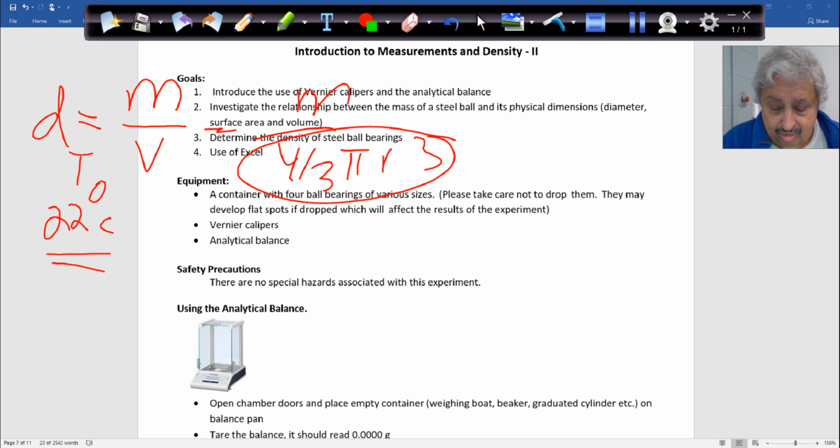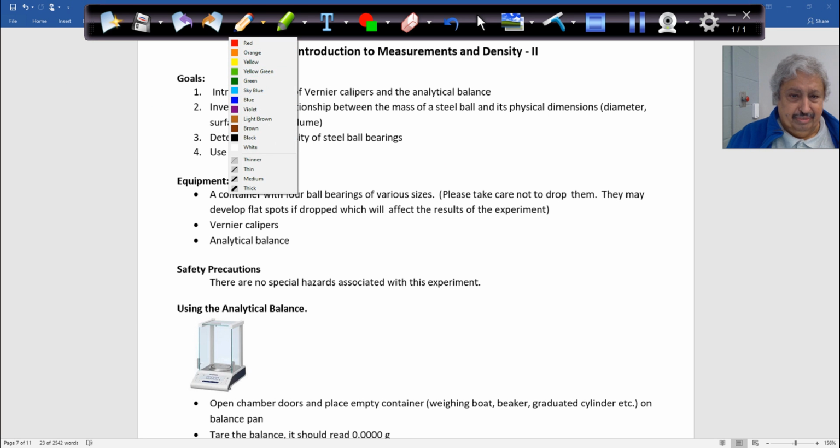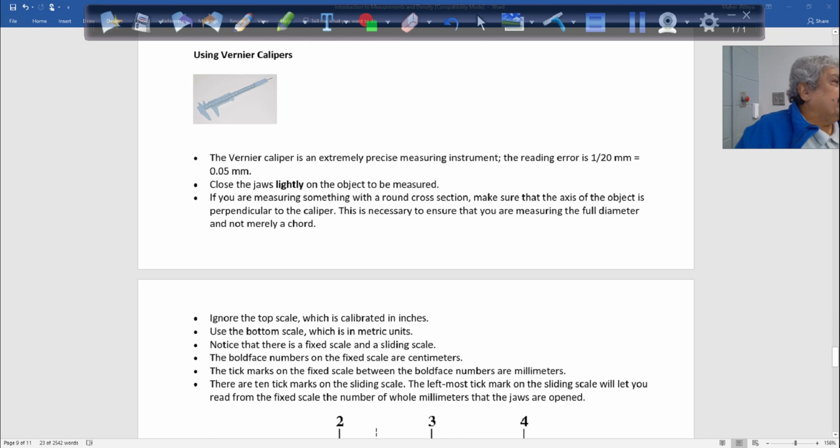Before we do this, I have to show the movie here a little bit for 1 minute. How to use this vernier is a little bit trickier, but very, very precise. Not accurate, but I would say very precise. It would be accurate if I knew the value in advance, but I don't know the value of them.